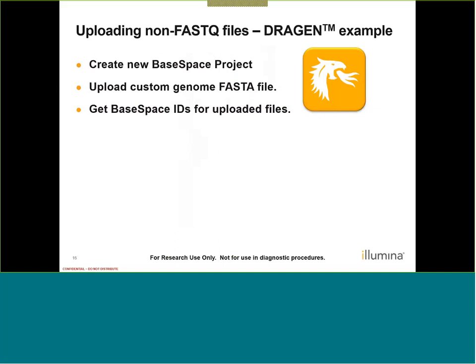And we're going to manipulate that file using one of the DRAGEN apps. And that is because DRAGEN requires building of what's called a hash table for a genome. And this is a thing that the DRAGEN software converts the FASTA file into a hash table that it can understand and use for any actual downstream analyses, such as our germline or somatic pipelines. So we're going to do this before we actually get into using one of the DRAGEN applications to run an actual analysis.